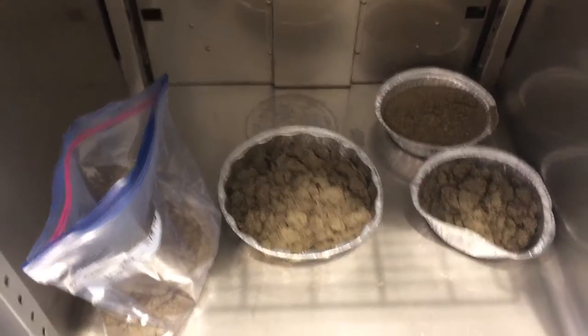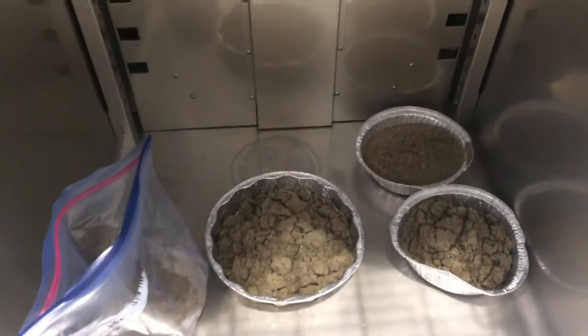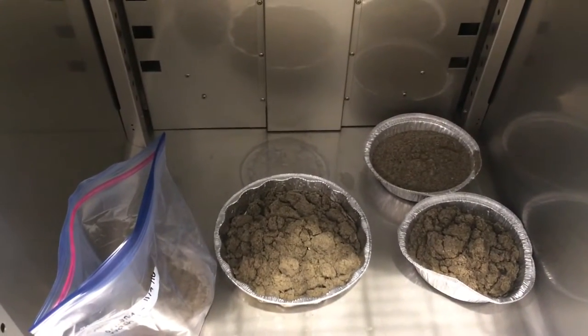Same thing on the second shelf, and on the bottom shelf — still not so much issue on the bottom here, but we don't want to have so much stuff that we're making the system overwork.